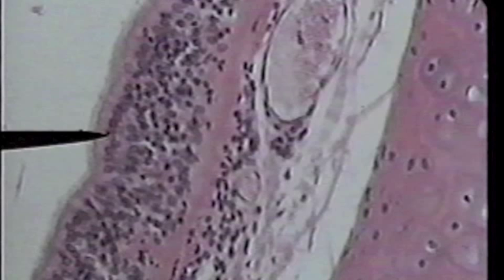The tip of the pointer is on stratified columnar cells. You can see many layers of cells. The most mature cells, where the tip of the pointer is directed, are clearly columnar in shape. You can see a row of nuclei in the basal region of the cell, and a pink cytoplasm in the apical region of the cell near the lumen.